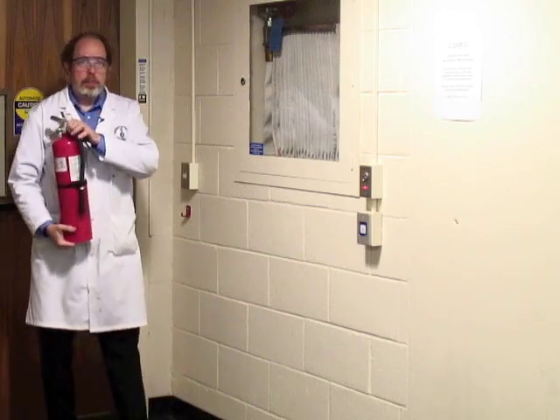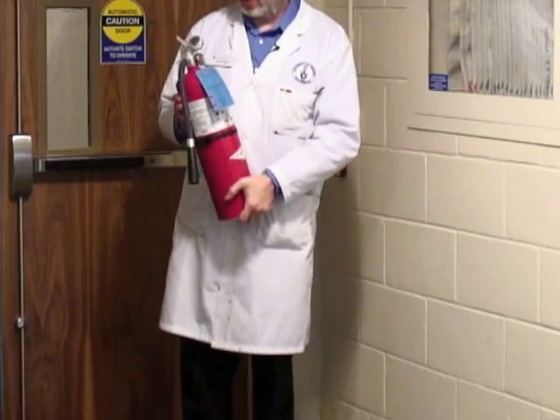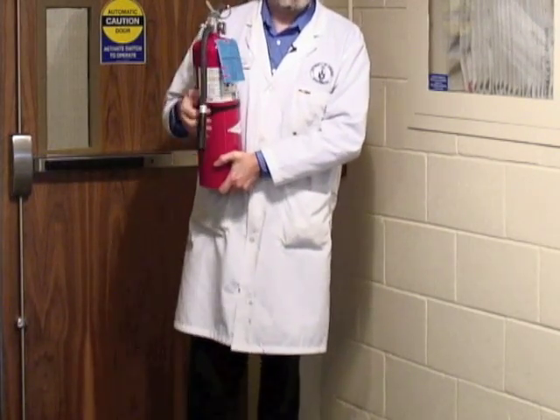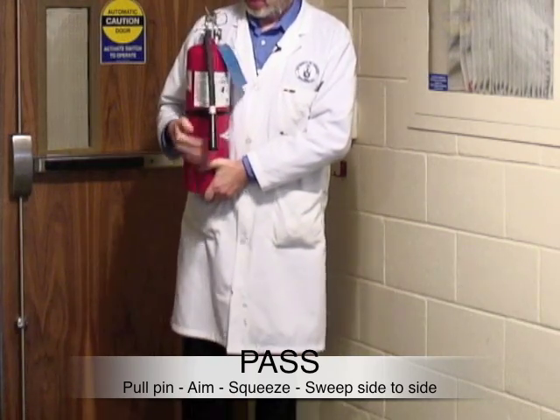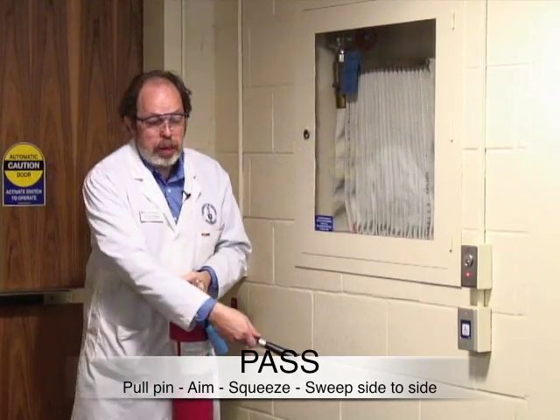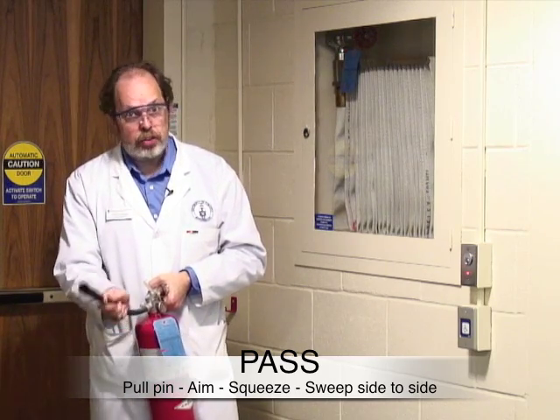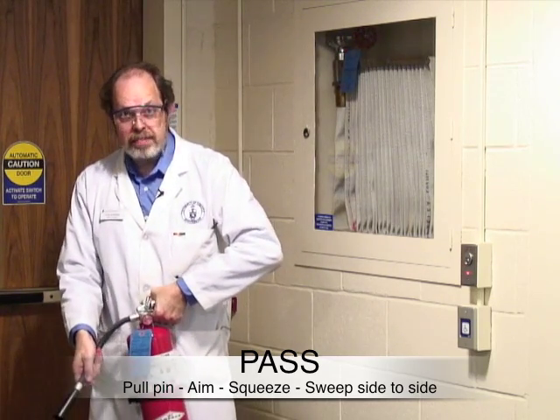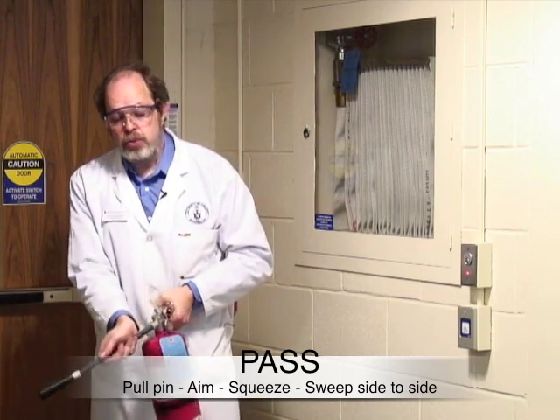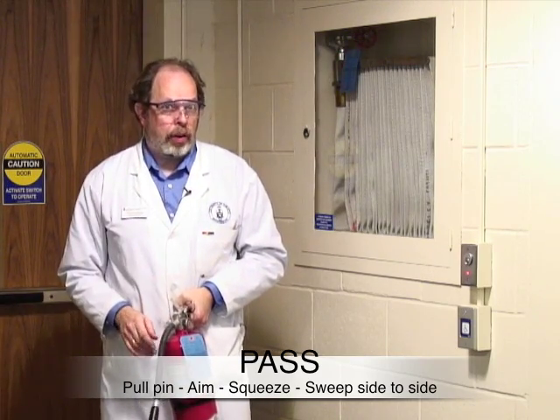The extinguishers within a lab will always be the appropriate kind. They hang in a bracket and there is a pin. The rule for fire extinguishers is PASS: pull the pin, aim at the base of the flame — not at the flames themselves — squeeze the handle which causes the extinguisher to discharge its extinguishing material, and sweep the hose from side to side so that you damp out the fire wherever it is.